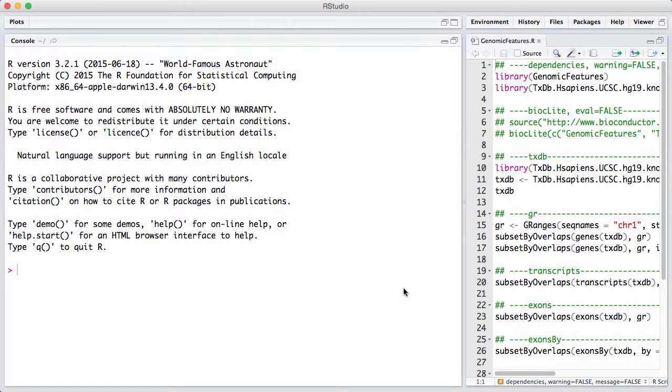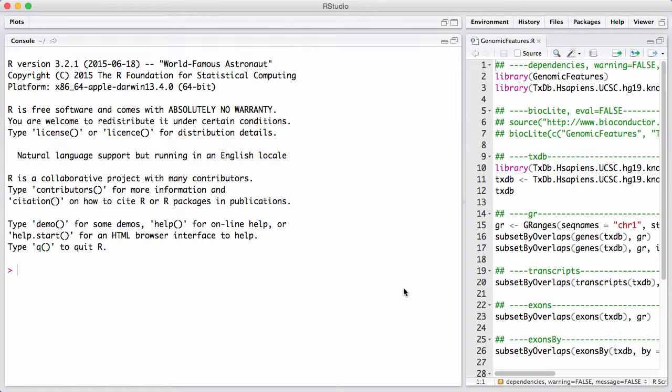In this session, we will discuss the genomic features package. The genomic features package provides support for something called TranscriptDB or TranscriptDatabase objects. The idea is similar to the relationship between the BSgenome package and the individual genome packages. So let's load genomic features and let's load a transcript database that is available for download from Bioconductor.